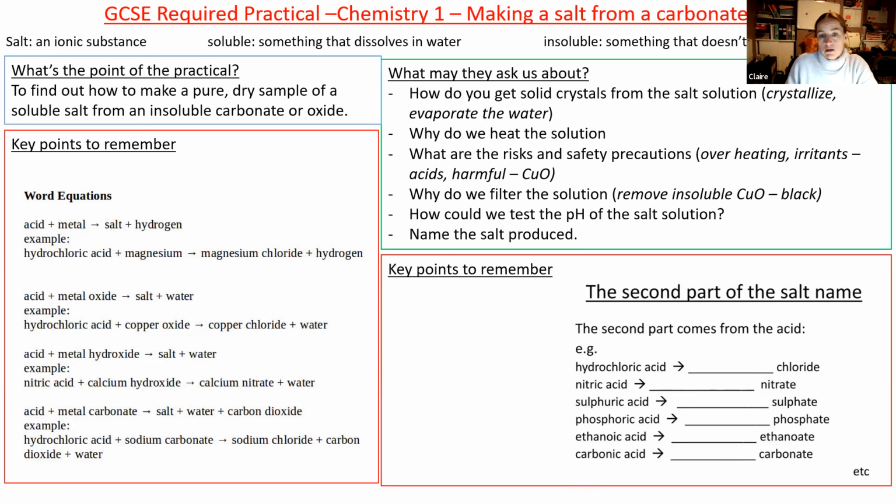That's really important. Risks, they often ask about risks. You don't overheat it. And acid is always harmful, or irritant, should I say. Copper oxide is also harmful. Another little question, why do we filter the solution?